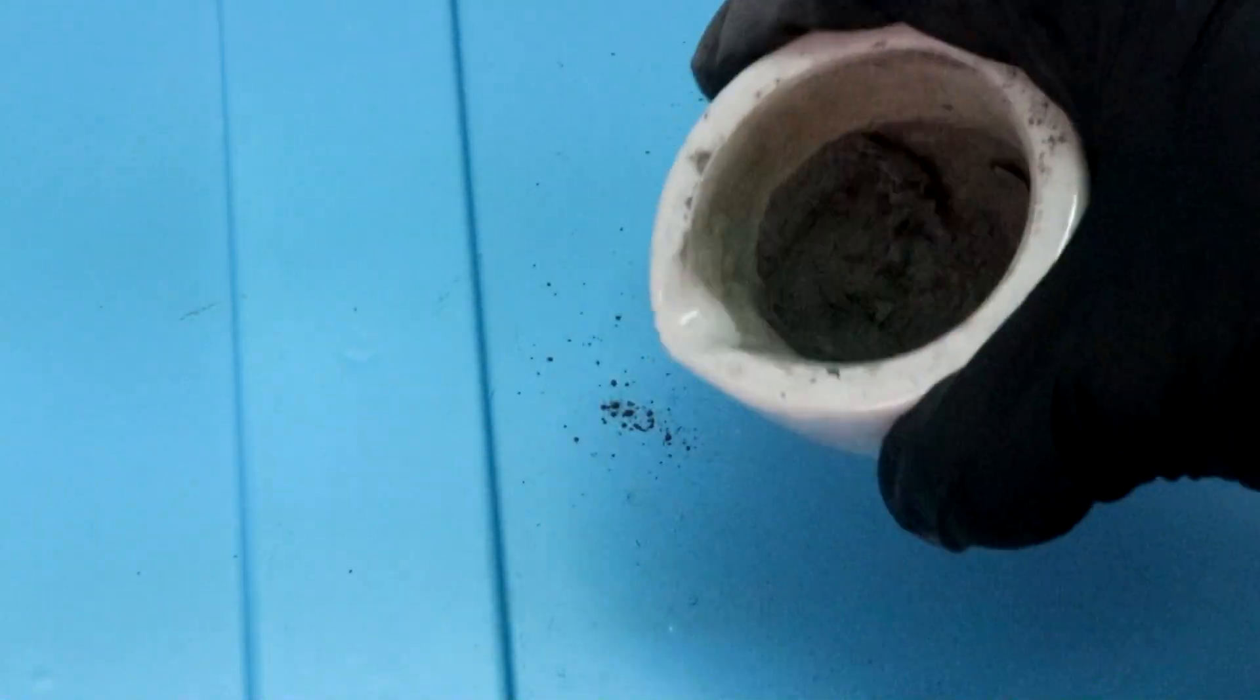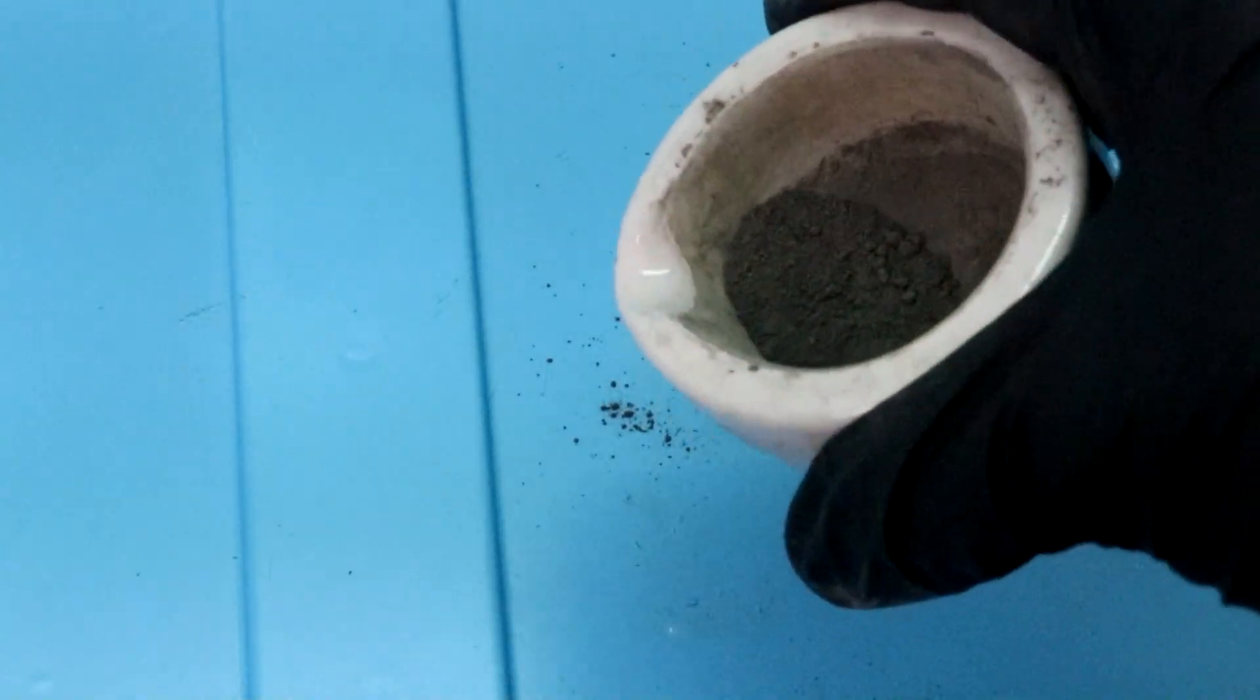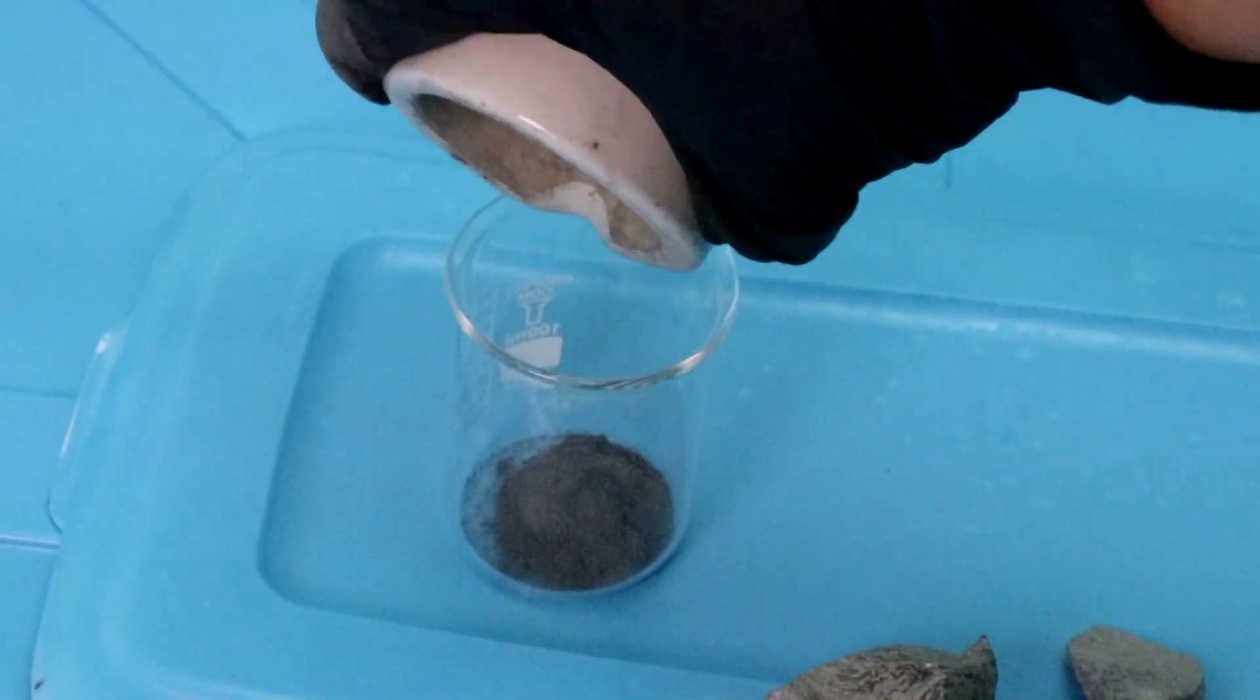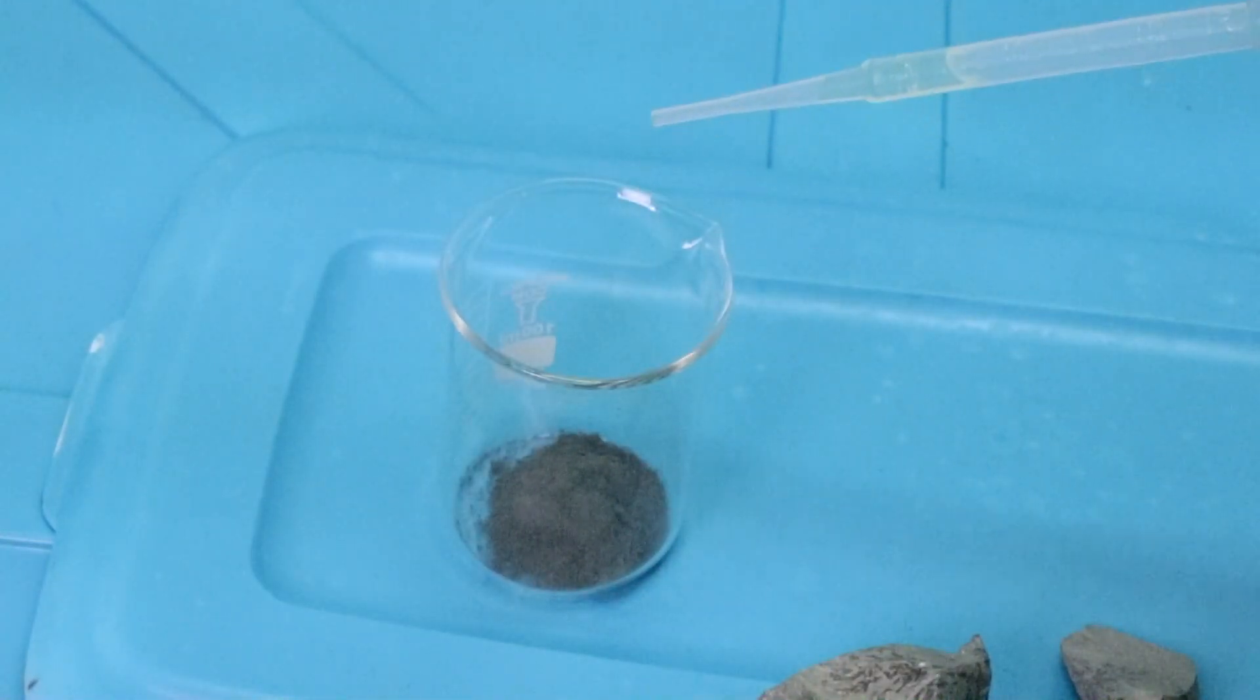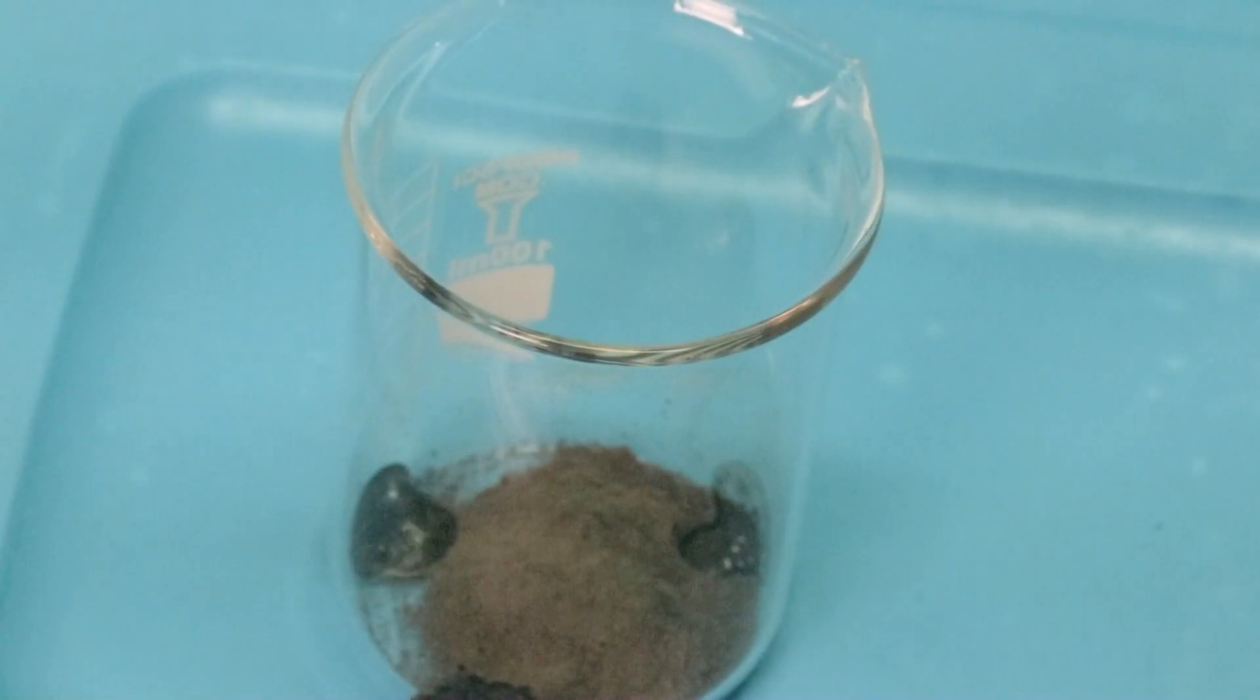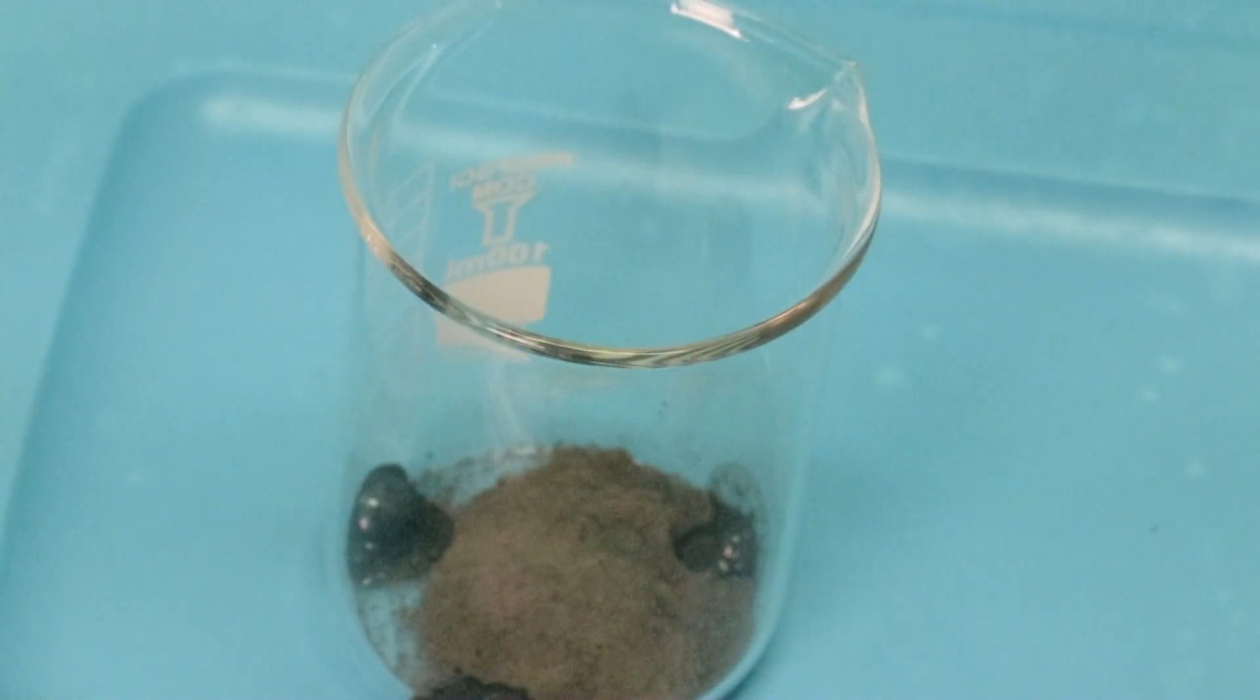Okay, so now that we've crushed our ore into a grayish powder, let's transfer it over into a beaker. And now when you drop in a bit of acid, you can observe that it bubbles profusely. It's destroying our acid.